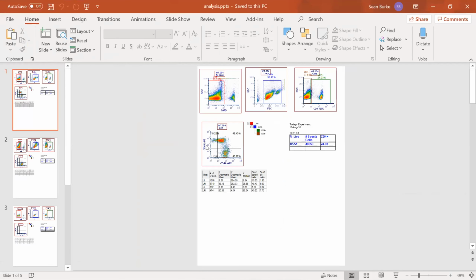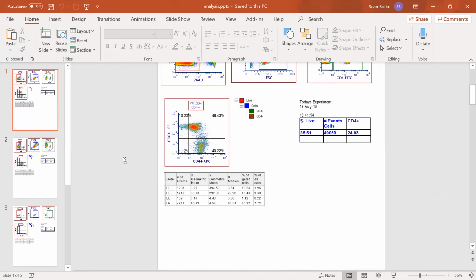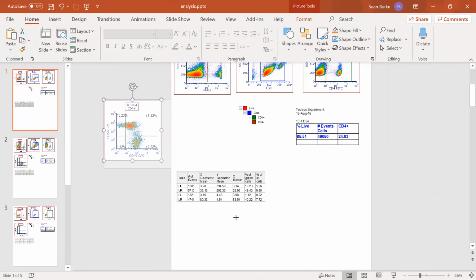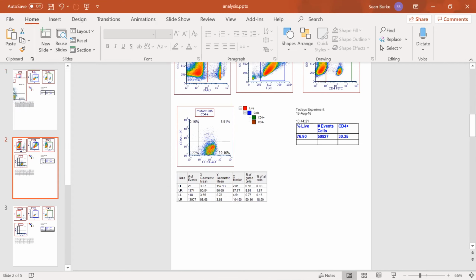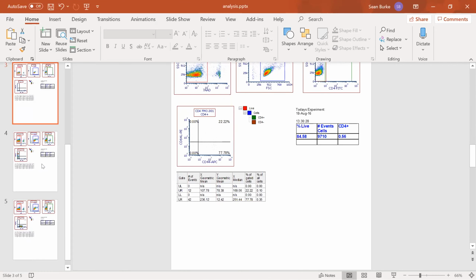So just like our one-off PowerPoint, we get all the plots, everything that we want at high resolution, vector graphics if we need to grab that and put it in a publication, but we have one slide for every data file, right?